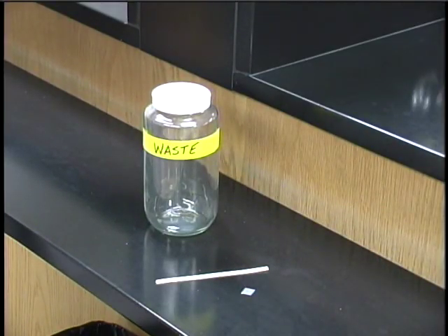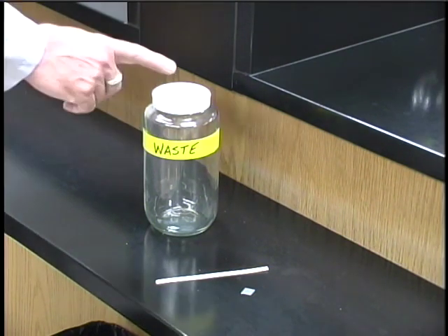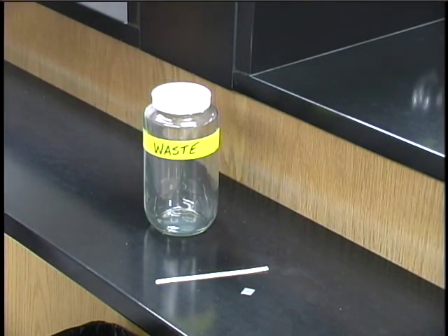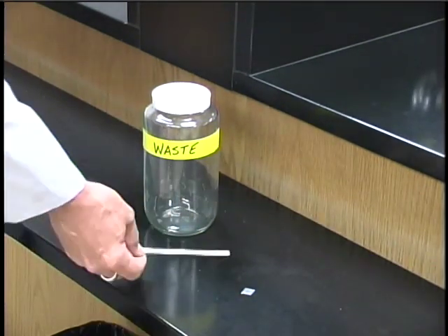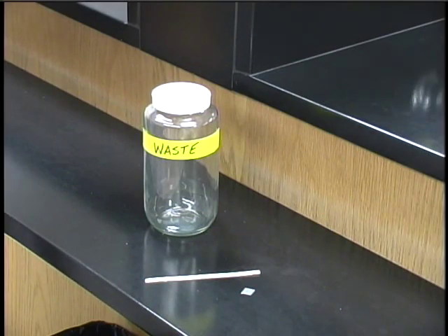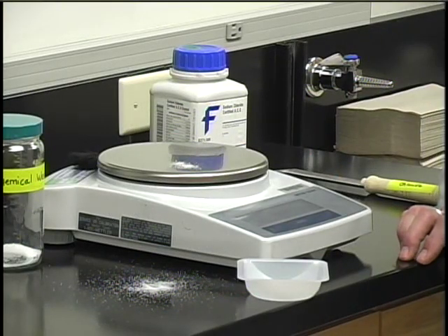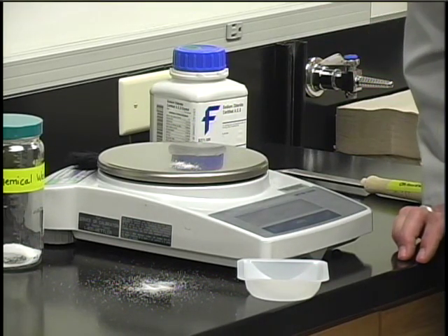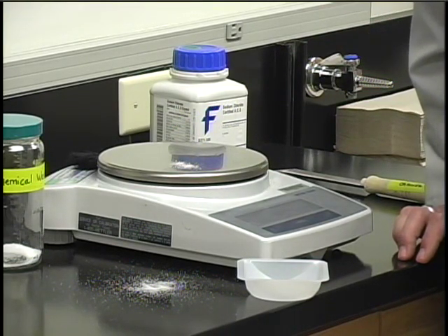Safe handling of chemicals includes proper disposal of them. When chemicals require special disposal, your lab instructions or your instructor will tell you and provide disposal containers. If no disposal instructions have been discussed, most chemicals may be disposed of in the sink — exceptions are items like pieces of metal or wooden splints that don't dissolve in water. If you spill any chemical, even a few crystals on the balance or countertop, you need to clean it up immediately.